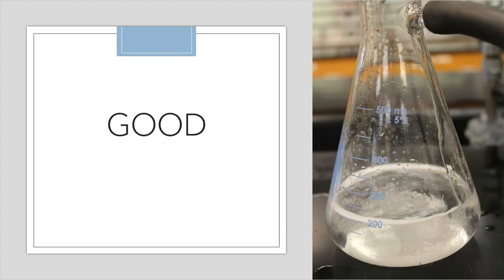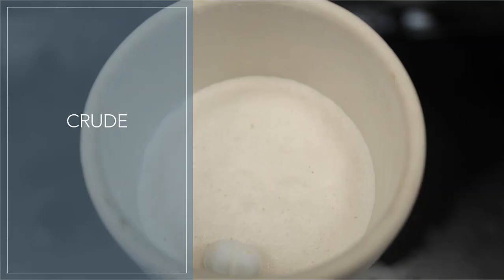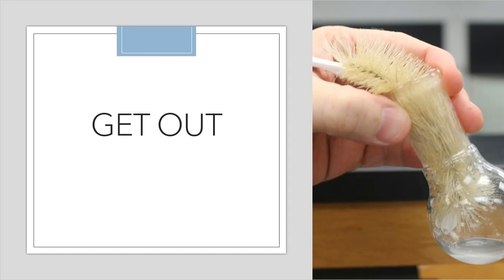And then after I poured everything through, I took another zoom in of that filter flask that sits down below. And this is what that filtrate looked like. So I felt really good about that. So I go back and I take a look at the crude product that's on my filter paper. And this is what it looks like. And I'm still trying to get out that extra crystal. So one more 15 mL portion of water went into that flask. And this time I took a brush, and I scraped around the insides of that flask, and I swirled it, and I poured it through that filter paper that had the crude on it. All right, so that cleaned up my boiling flask quite a bit.